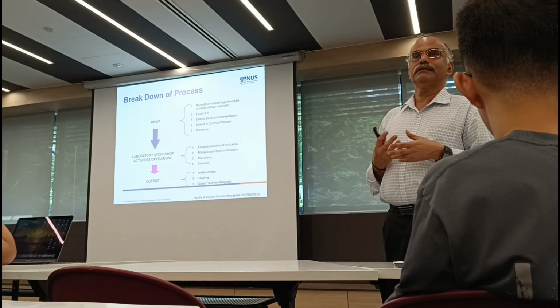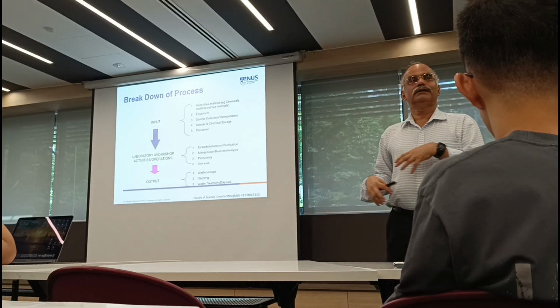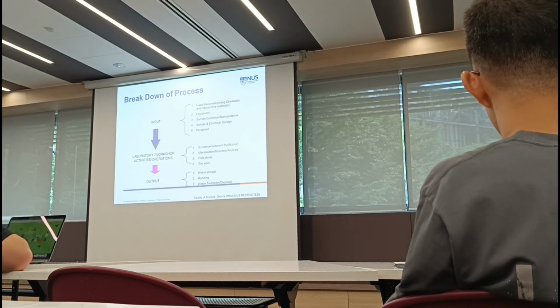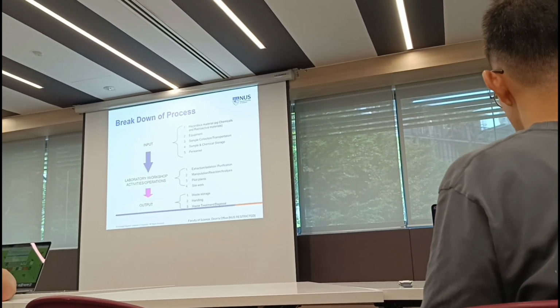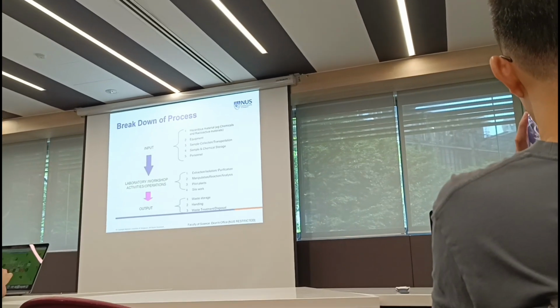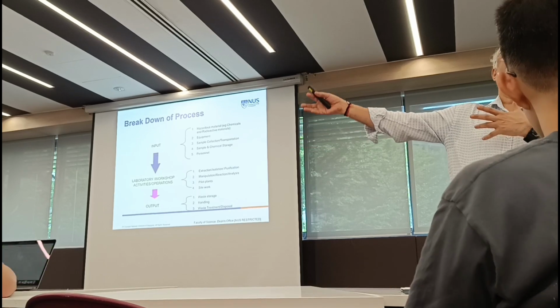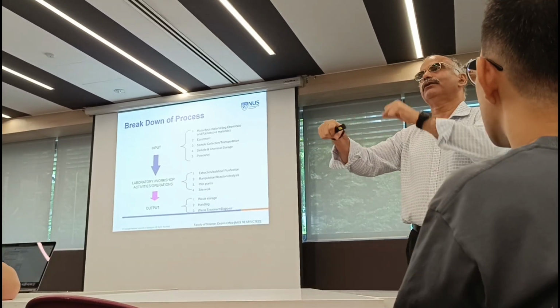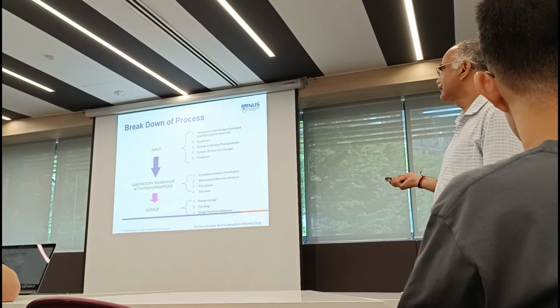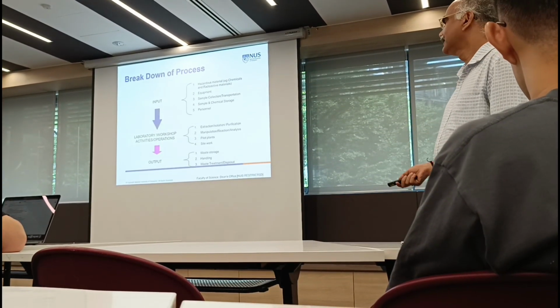Then many equipments are needed, right? Hot plate stirrer, roto evaporator, I don't know, distilling setup, all these kind of things. From the procedure itself, you know what kind of equipment you need. Yeah? And then sample collection, transportation. So, for example, sometimes you need to bring a solvent from the chem store to your lab, and how are you going to bring it? Where do you find those samples, etc. The reagents, right? Sample and chemical storage, personnel involved, etc.